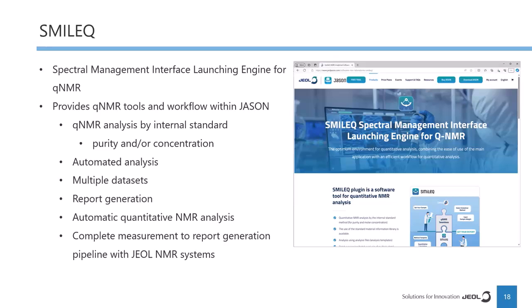We have tools that allow you to do internal standard, external standard experiments, purity and/or concentration, automated analyses, the analysis of multiple data sets, generate reports, and provide automatic quantitative NMR analyses. And as I mentioned, we have a complete measurement to report generating solution for JEOL NMR systems.